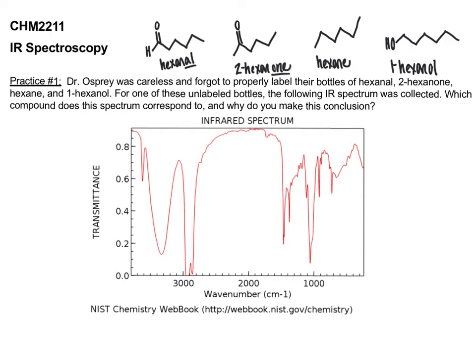As we look at the spectrum here, what I would recommend looking at first - and remember that you can refer back to table 12.2 earlier in the handout and from our last video that gave some diagnostic signals. The two diagnostic signals that we focused primarily on were that at around 1700 inverse centimeters, if we have a carbonyl group, we expect that carbonyl group to be there and very strong. The other key signal was that around 3300 inverse centimeters, we would expect to find hydroxy groups that would be very broad.